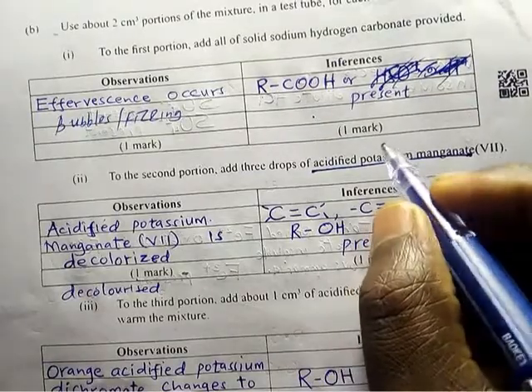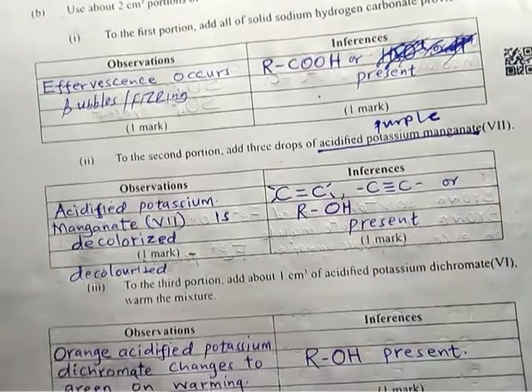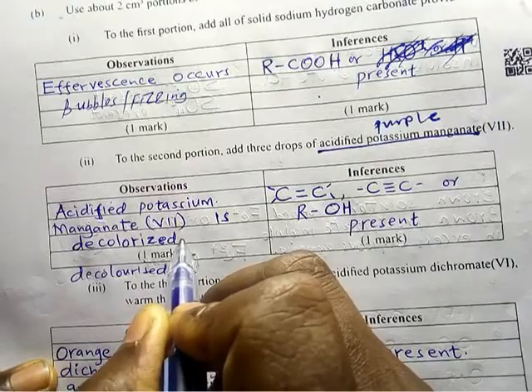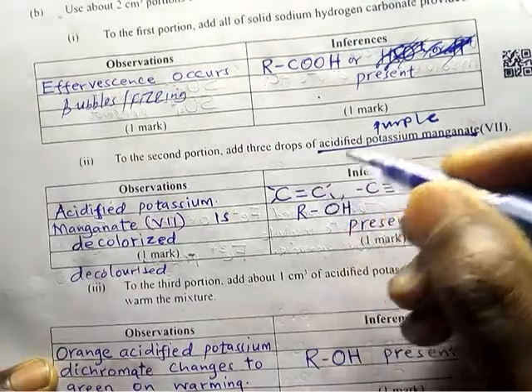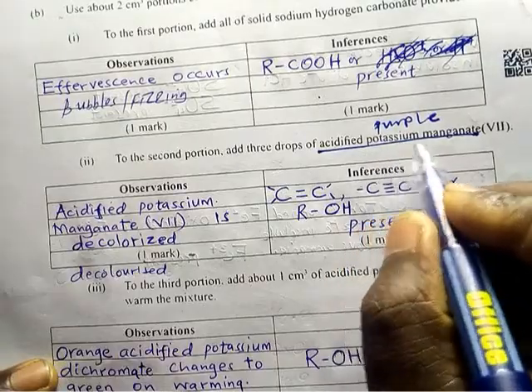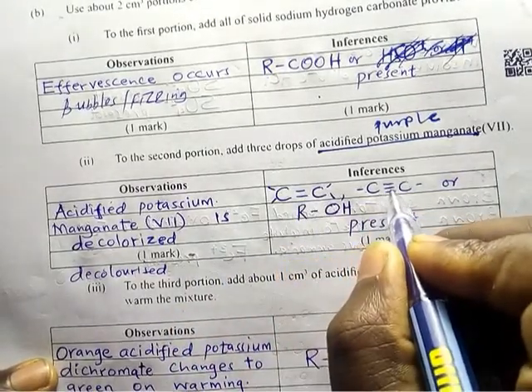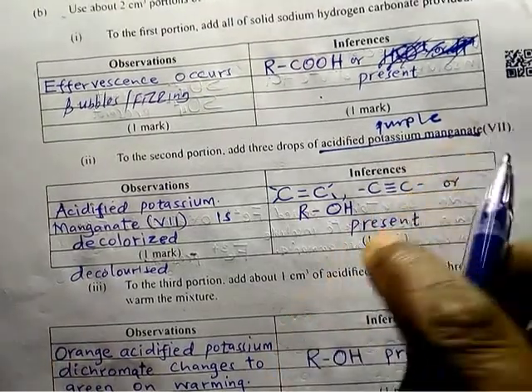To the next portion, add acidified potassium permanganate. Remember this one is purple. What will happen to the purple acidified potassium permanganate? It is decolorized. To decolorize means that the color changes from purple to colorless. If that happens, you should know that a double bond, triple bond, or an alcohol is present. If acidified potassium permanganate changes color from purple to colorless, then an alkene, an alkyne, or an alcohol is present. And if it doesn't, they are absent.